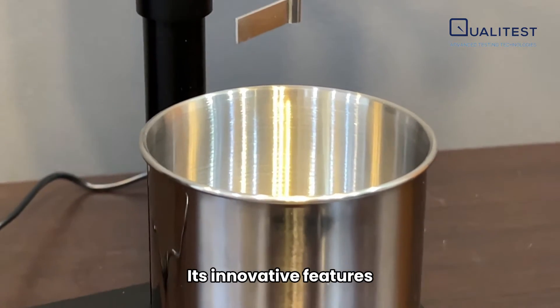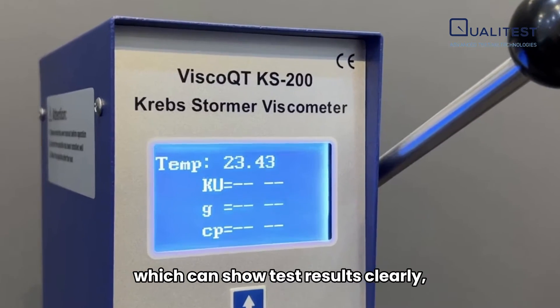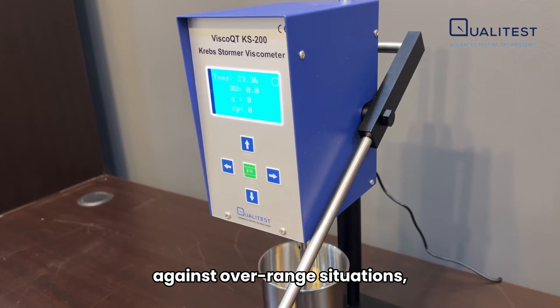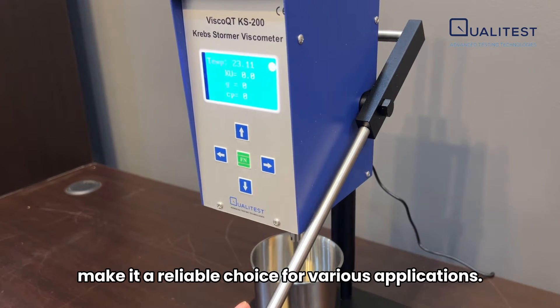Its innovative features, such as the large LED digital display which can show test results clearly, magnetic rotor for easy handling, and self-protection function against over-range situations, make it a reliable choice for various applications.